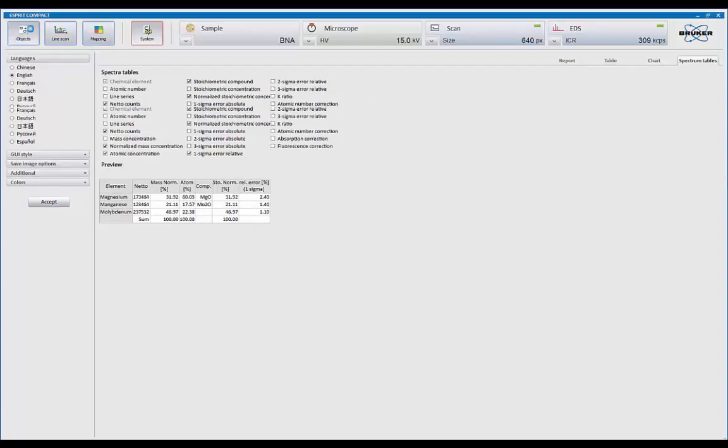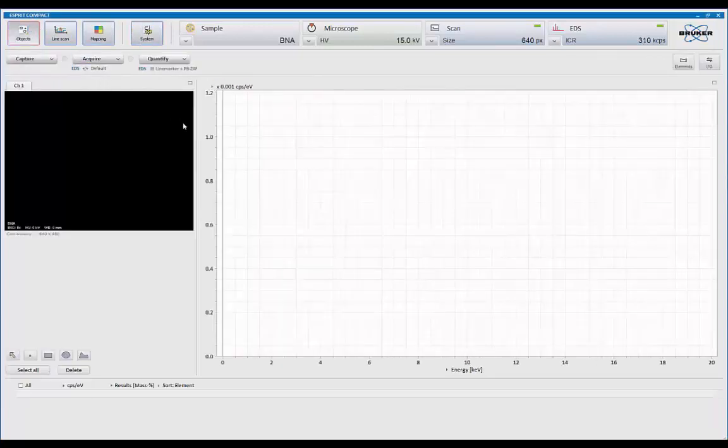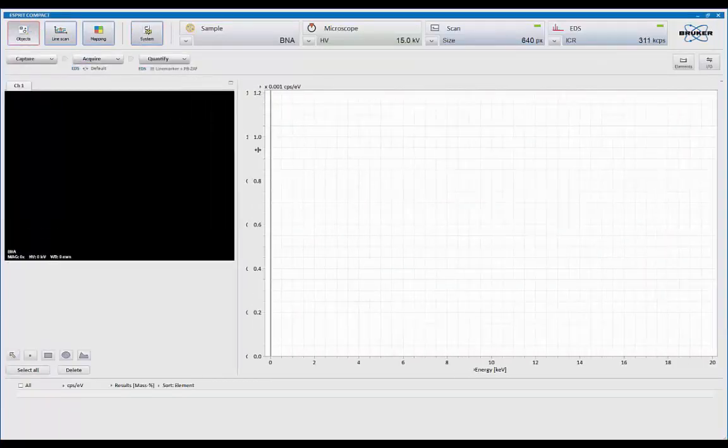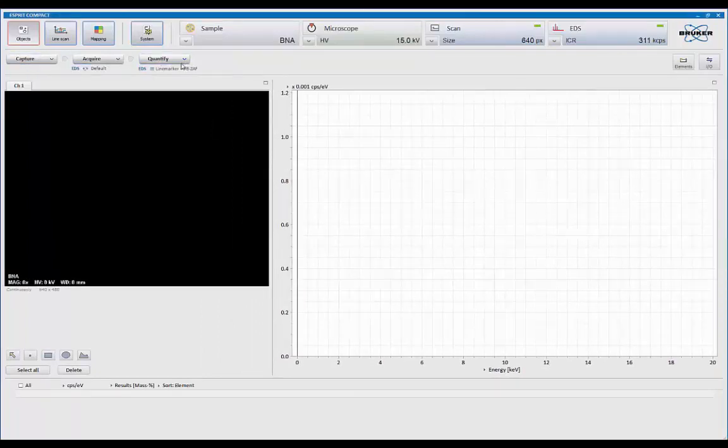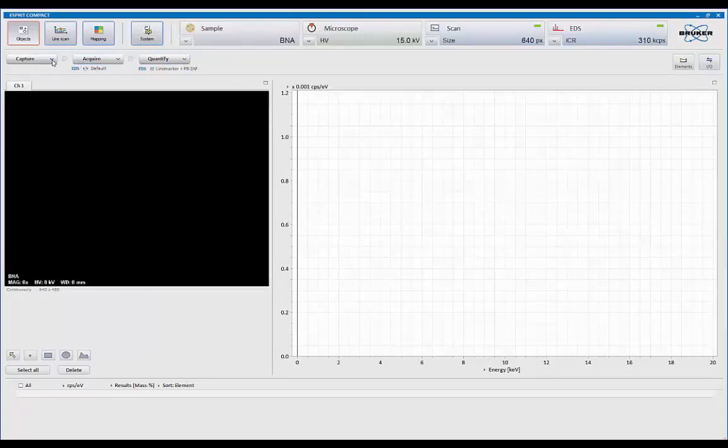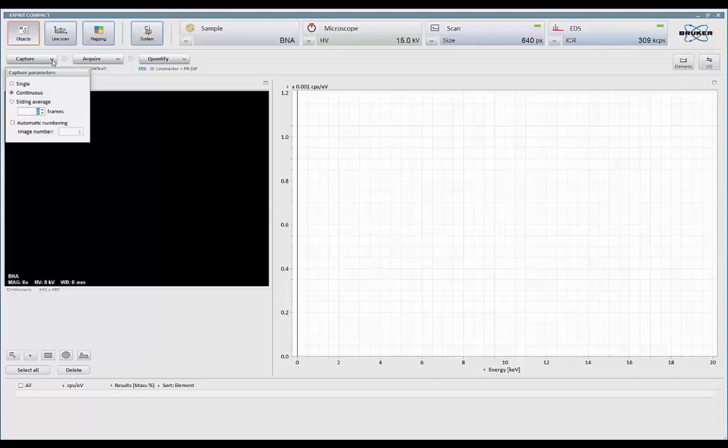So now let's go over to object mode. Now in object mode, I can now collect the image. So I can simply say capture. So any place in the software where you see a down arrow key, that's your menu. So if I click on that, here's all the controls for capturing an image. So we can do a single frame, a continuous frame, and you can do sliding average. You can also activate automatic numbering if you wish.